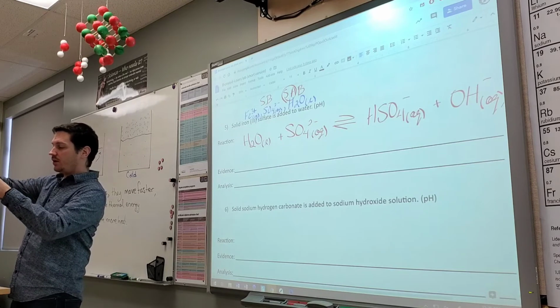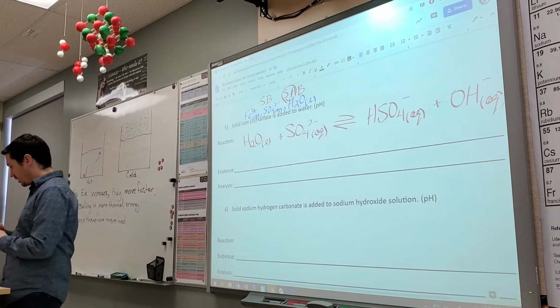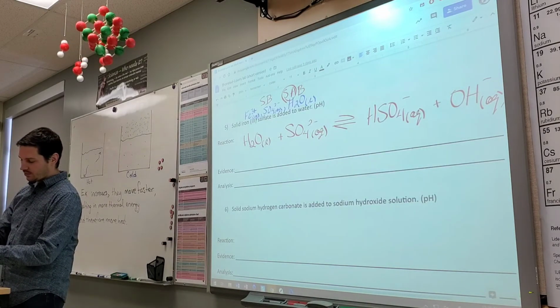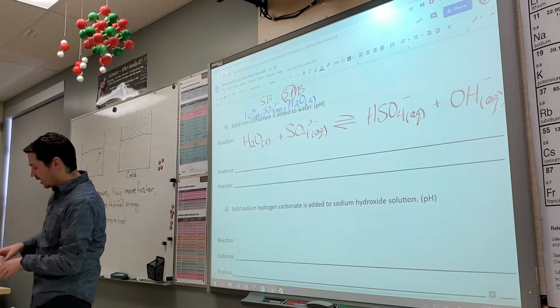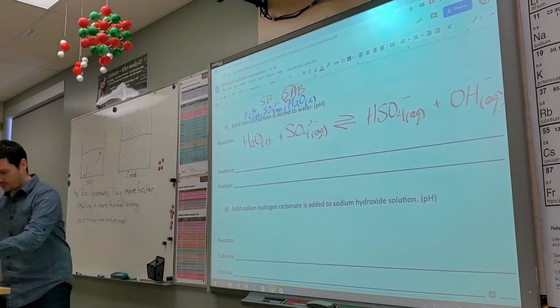So I'm going to put a little bit of water in here, and I'm going to test. I'm going to add some of this. And I should be doing this a little bit more carefully than what I'm doing, but c'est la vie, whatever. Okay, perfect. And I'll use my absolute technical instrument, a pencil, to stir it up.